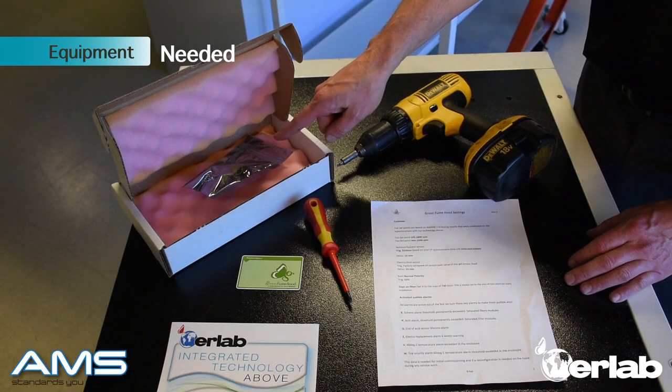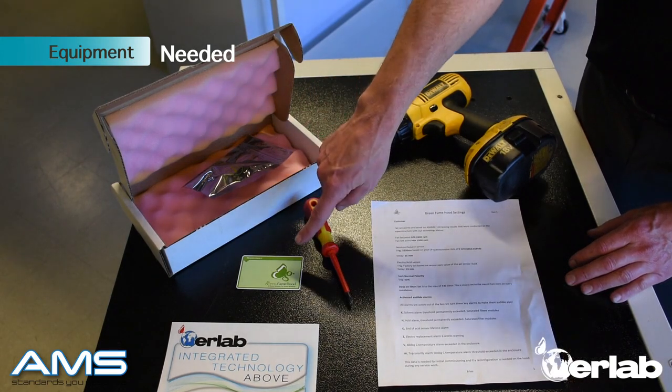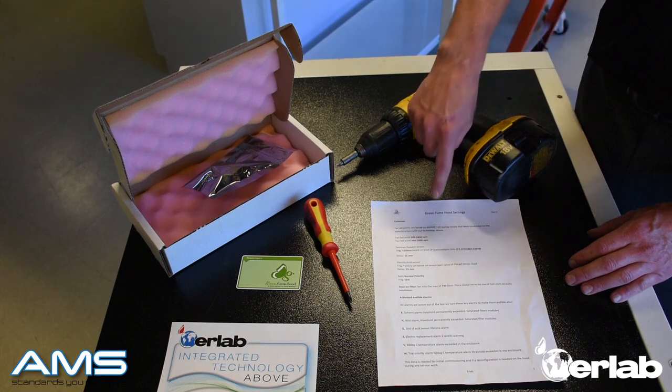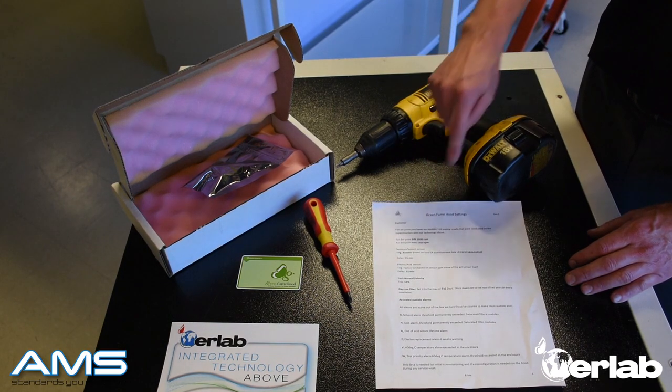You're going to need to locate your new acid sensor — it should be in an electrostatic bag. You're also going to need your green maintenance card, a number 2 Phillips handheld screwdriver, a power drill with a number 2 Phillips head, and your green fume hood setting sheet. If you have lost this, please contact Ur-Lab.